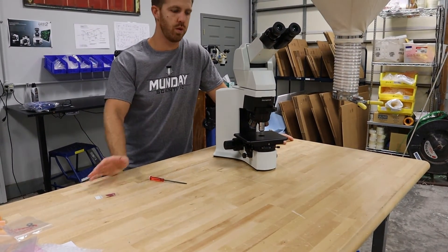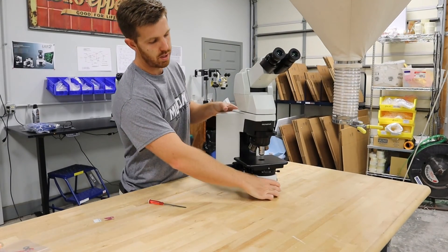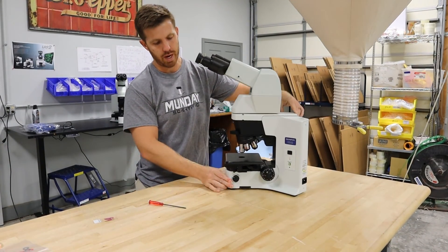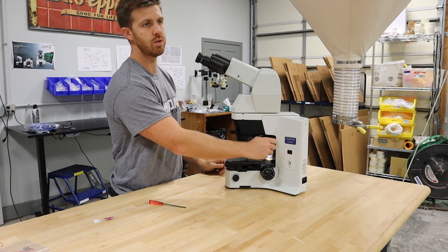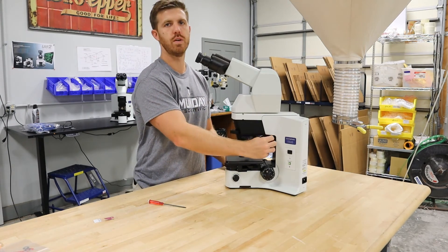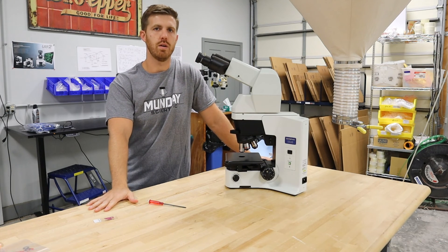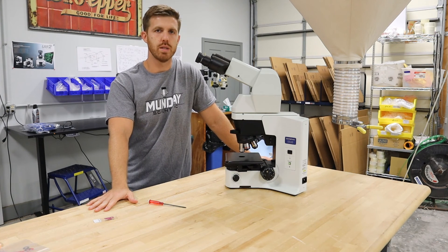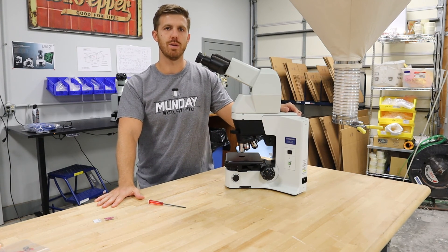It's exactly the same as the BX-41. You just have to get those centering keys out. Once you set it, it really won't go out of Kohler because there's no way to change it. Then screw your keys back in and the microscope is ready to use. If you have any questions, give us a call at Munday Scientific, and you can visit us at mundaymicroscope.com or microscopemarketplace.com — that's our online marketplace with all of our microscopes and microscope accessories. Thanks so much.